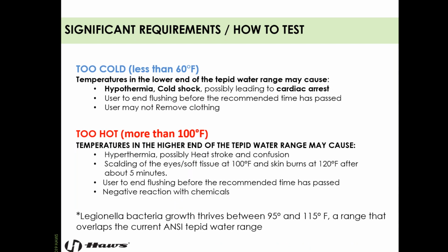If it's too cold, again, you're risking hypothermia, cold shock, possibly leading to cardiac arrest, especially if your body is in really bad condition. And we need to make sure we get all of those chemicals off of you as quickly as possible. And cold water, if it's too cold, may prevent that, especially if it's a thicker substance that's oily and so on. So making sure that the temperature is high enough that it's not going to congeal whatever the substance that's on you is important as well.